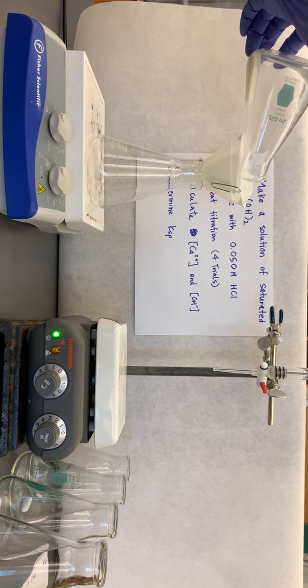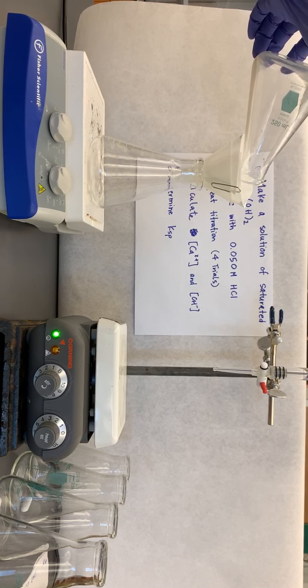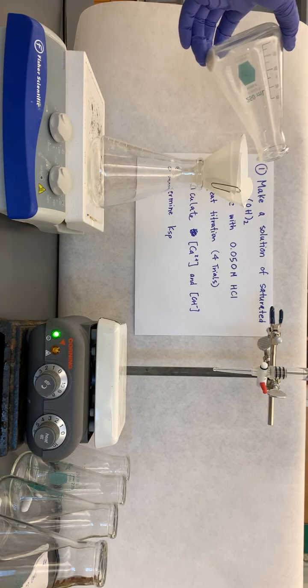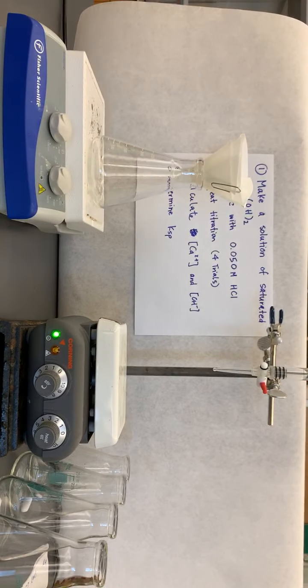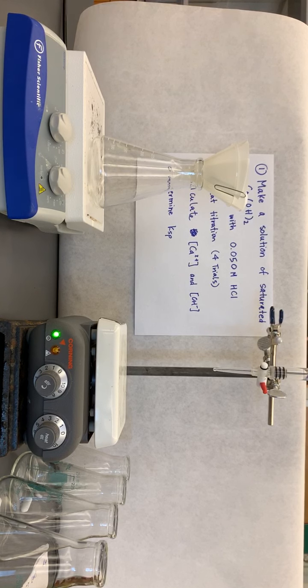And any solid that was in the solution is going to be left behind. Okay? And I'm not going to get a perfect, I'm going to leave a little bit behind. I really don't need 60 mils, so I'm just going to go ahead and let that drain through. Okay?